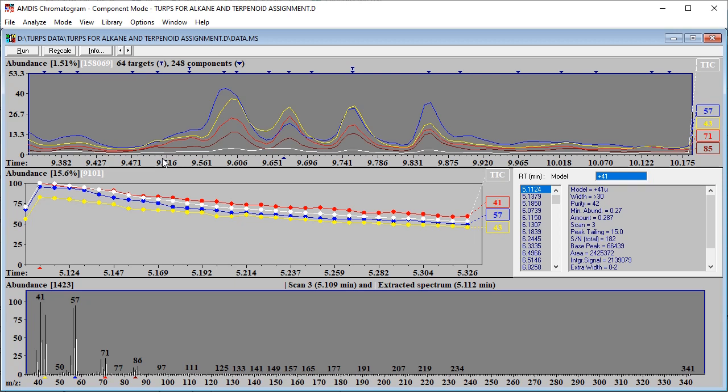So the same as I demonstrated here for alkanes, you should find a list of monoterpenes, then look up their spectra on the NIST chemistry webbook, and by looking at those mass spectra try to identify fragment ions that are common across many monoterpenes. Then you make their extracted ion chromatograms visible in AMDIS, and look to try to find peaks where many of those fragment ions go up and down at the same time. In the next slide I'll show you how to get the retention time and the peak area of the compounds you then identify as monoterpenes.